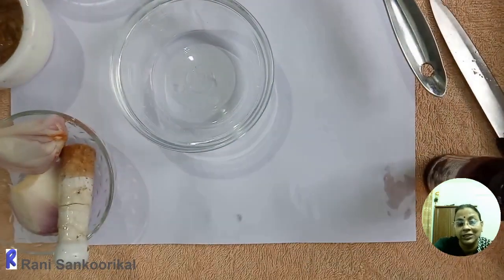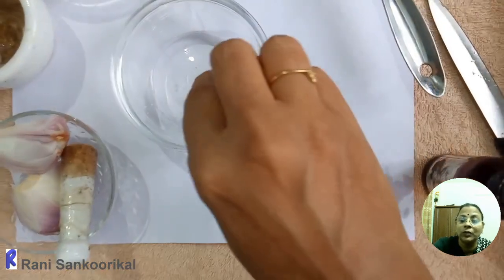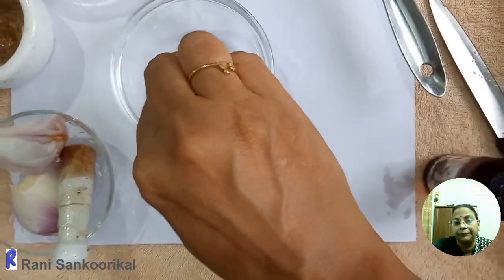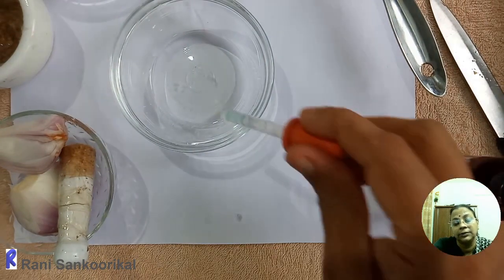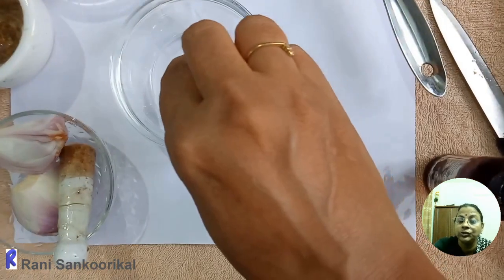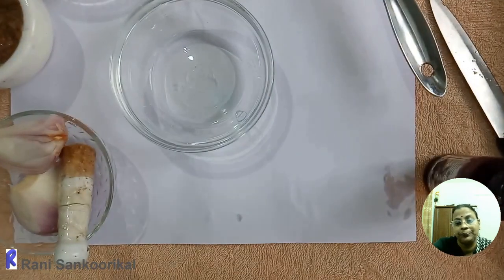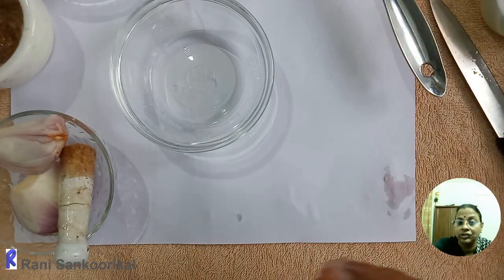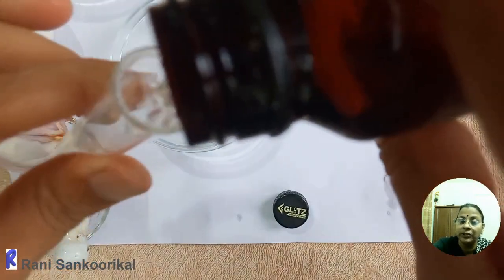When you are keeping it aside, make sure that it is not mixed by shaking it. Without shaking, slowly keep it aside. Here I am showing how to add onion solution into a half-filled ethanol containing test tube. First take the test tube, then half fill it with ethanol.